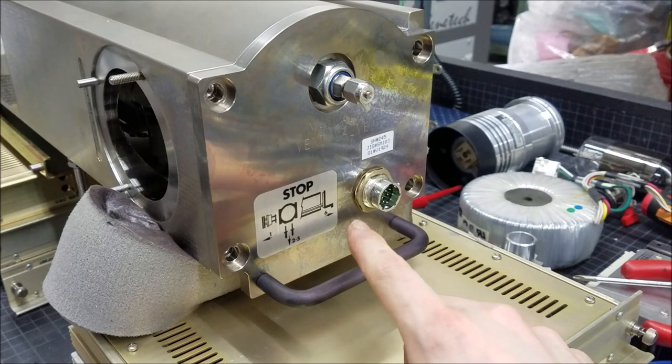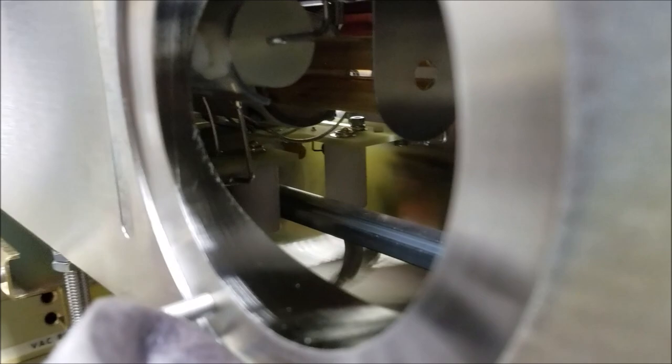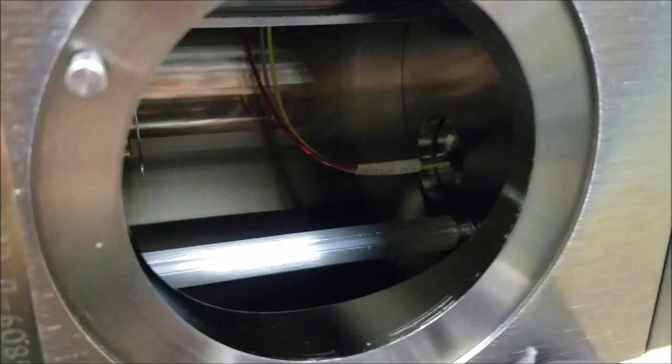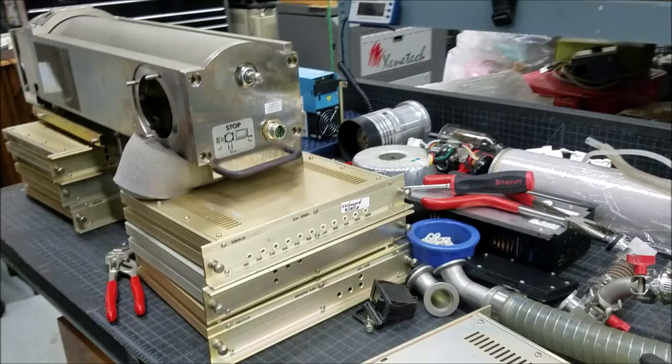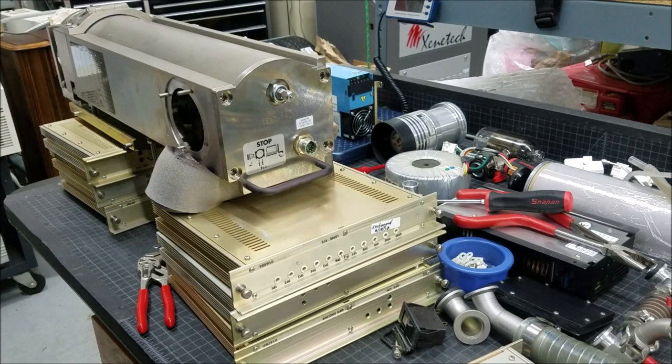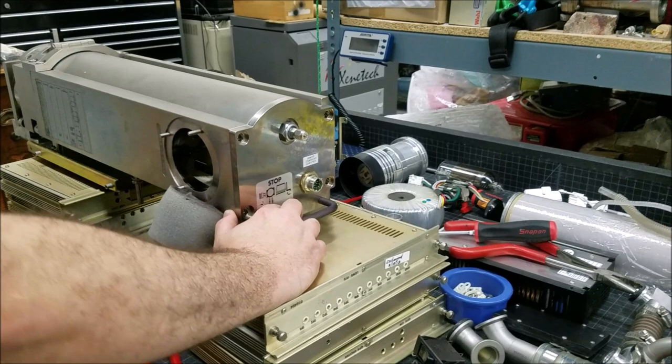According to the instructions I should now be able to grab this handle and pull this section directly out so we can see what's on the inside. However, on the inside it looks pretty busy and connected and doesn't want to easily come out. Time to invite Adam over and have him yank the handle, because if he breaks it, it's not my fault. Time to be a burly man and give it a good tug — check on the inside first just to make sure you're comfortable pulling it out because it looks like quite a few things are still connected in there.